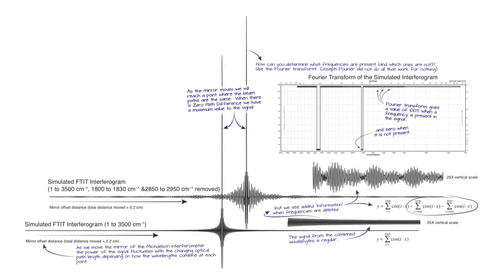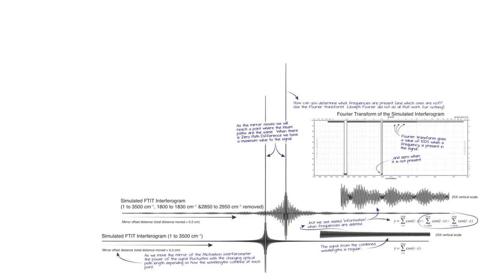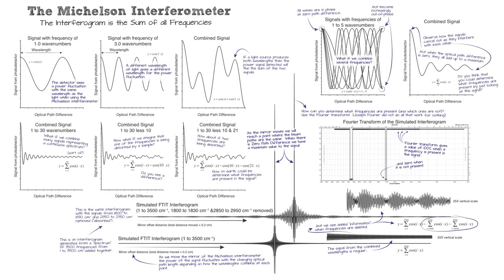So there's sort of the notes on adding up frequencies in the interferometer. The interferometer is an absolutely essential and very clever engineering marvel that is in your instrument, and there's another presentation on the physical aspects of your instrument, where the light source is, basically how your interferometer is built. There's lots of ways to build them. Just Google interferometer. There's tons of high-tech companies out there making interferometers for spacecraft, for spy satellites, for scientific experiments.